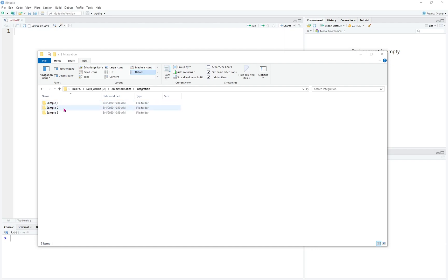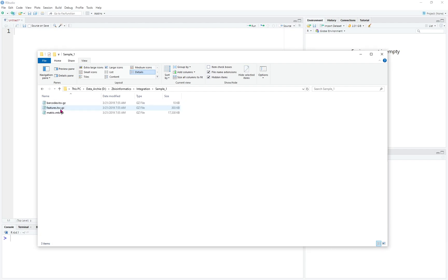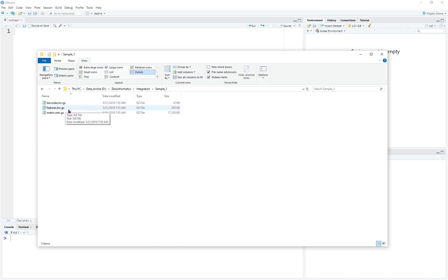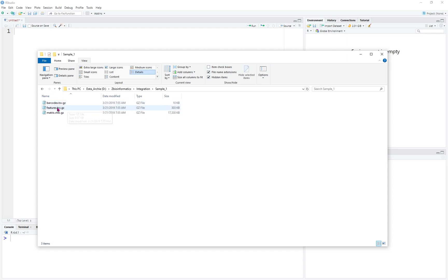We can organize the data into specific folders. For example, sample 1, sample 2, and sample 3. Sample 1 contains the barcode TSV file, feature TSV file, and the matrices. Please check the other video about what data is specifically presented in the barcode, feature, and matrix file.